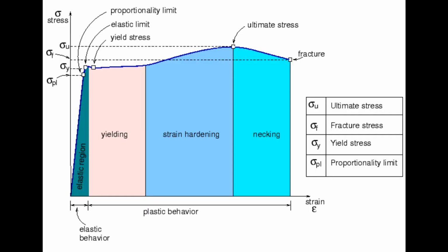A typical stress-strain curve would look like the one in the figure. In reality, not all stress-strain curves perfectly resemble the one shown here. This stress-strain curve is typical for ductile metallic elements. Another thing to take note of is that the figure shows an engineering stress-strain curve. When a material reaches its ultimate strength on the stress-strain curve, its cross-sectional area reduces dramatically, a term known as necking. As the computer software plots the stress-strain curve, it assumes that the cross-sectional area stays constant throughout the experiment, even during necking, therefore causing the curve to slope down.